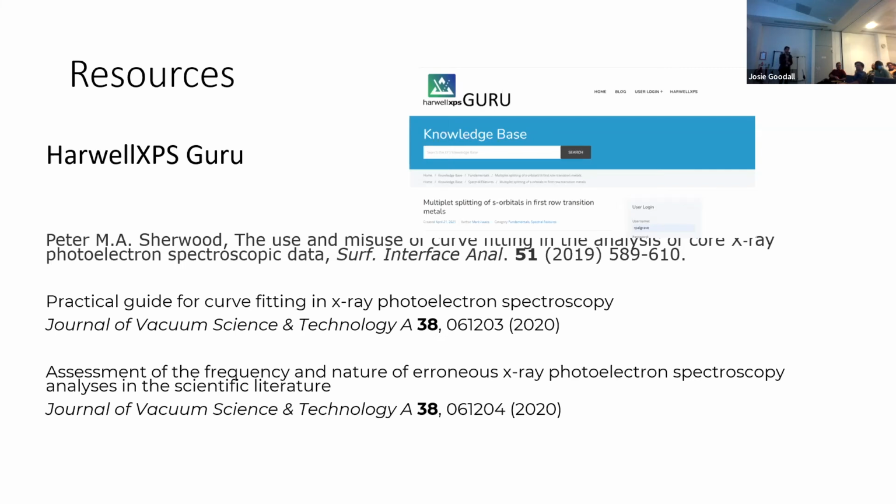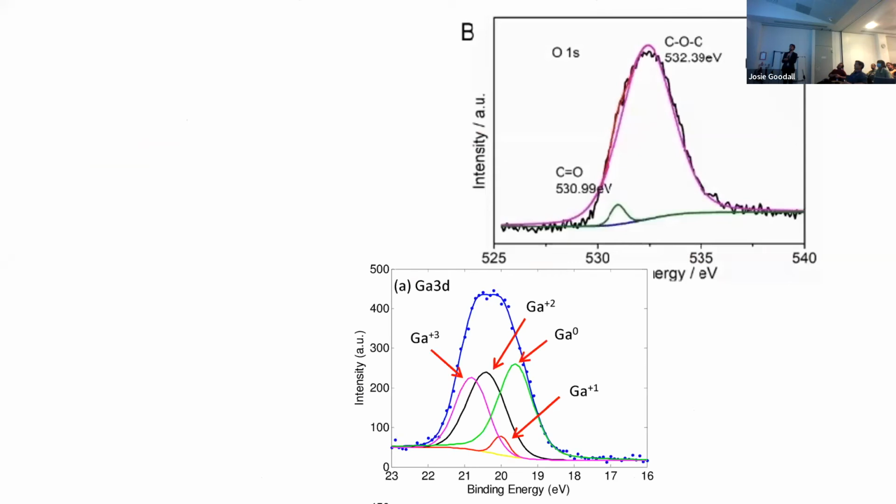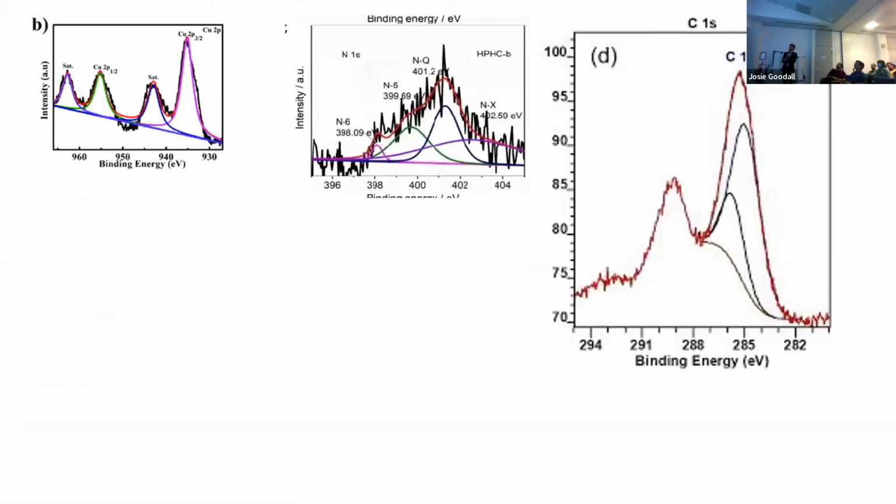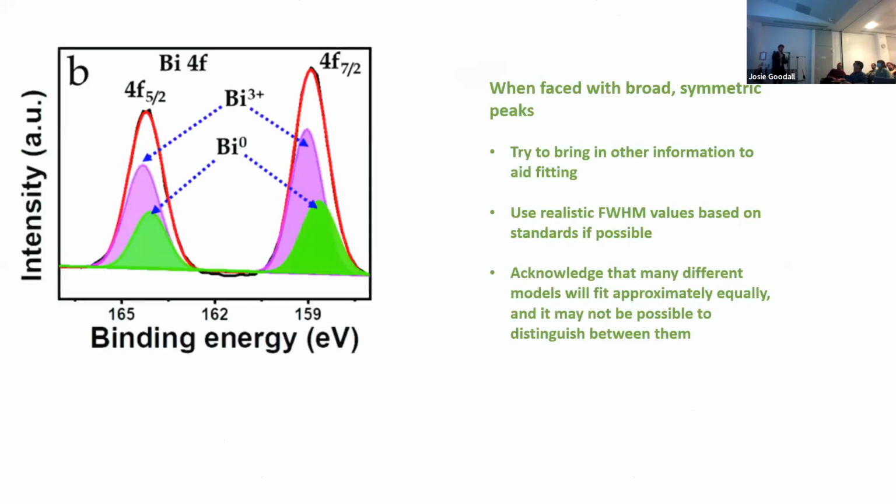Any questions? Let's go back to the second section, because I think I missed the last point. Can you speak up a little? So number two, was that? Yeah, the last point. Oh, sorry. So this is fitting symmetric peaks, or attempting to fit symmetric peaks. Is this what you mean? Yeah, the last point of this slide.